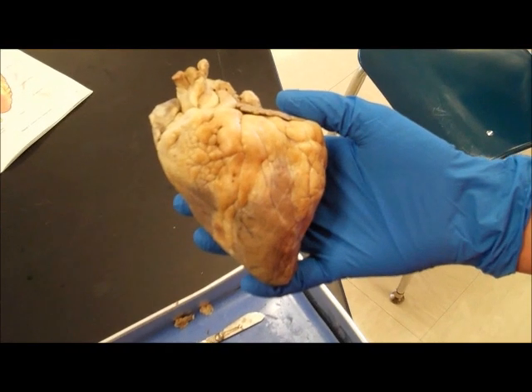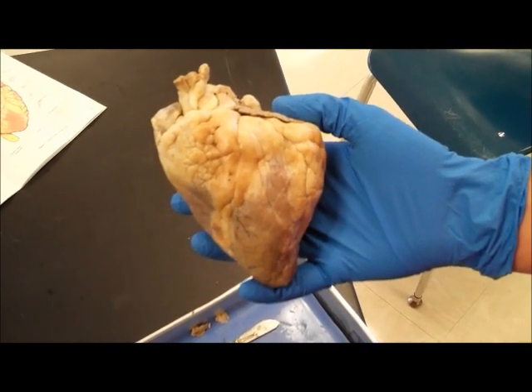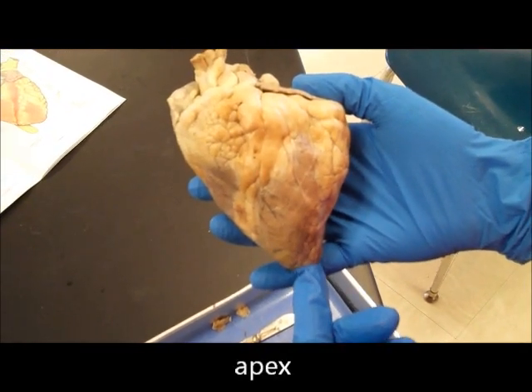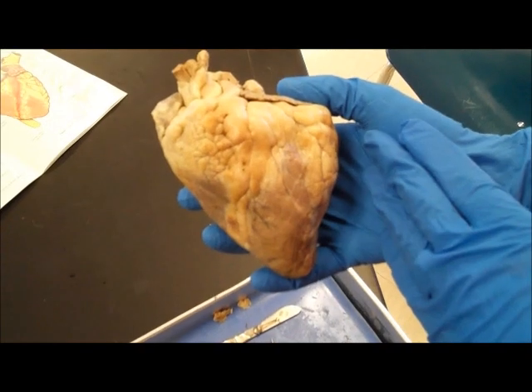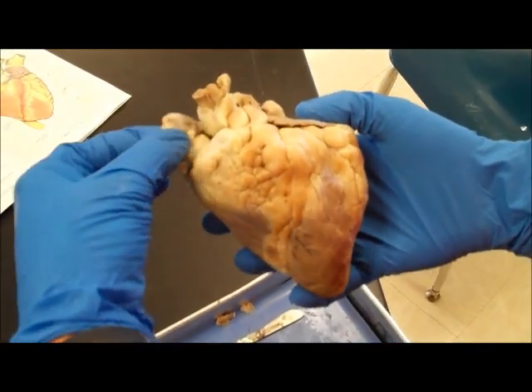All right, so what we're looking at today is a sheep heart, and we're looking at the ventral side of the sheep heart. We can see on this ventral side the apex of the heart at the bottom. When you orient the heart, the left side you see is actually the right side of the heart, and the right side you see is the left side of the heart. So up here, we have some flap-like structures.